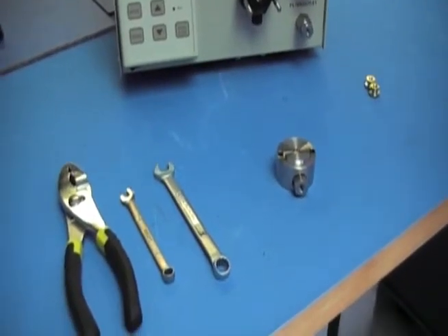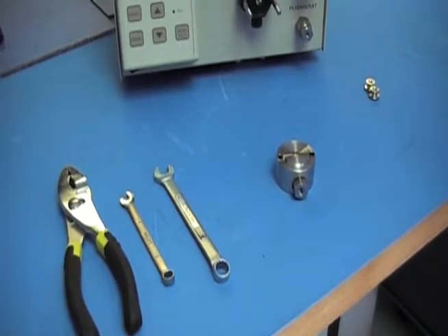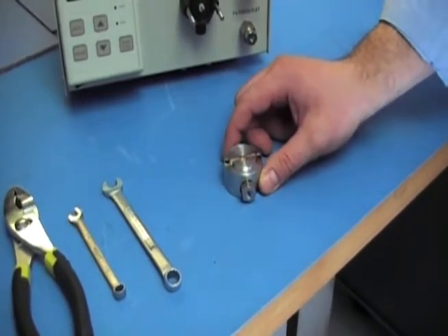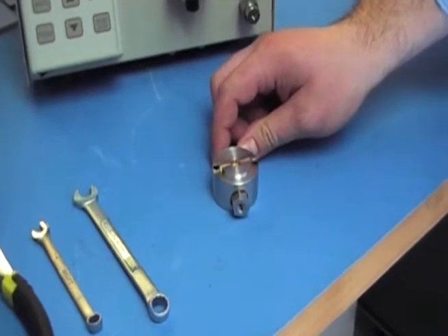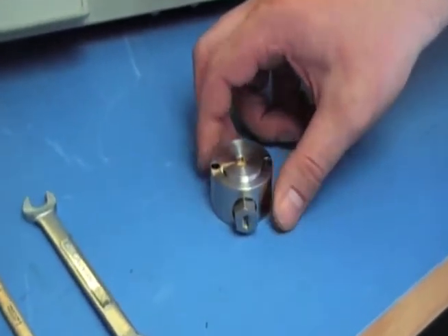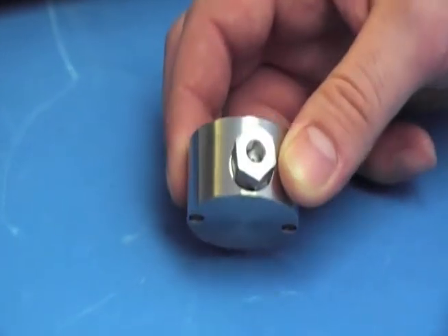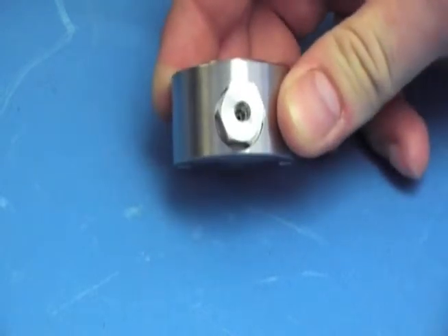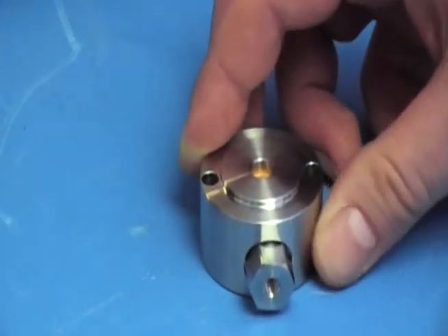After installing the new seal and/or installing the new check valves, you've got to put the head back on the pump. Before you put it on, make sure you have the right orientation so your flow path is correct. The inlet is always the bigger of the two ports — that would be your inlet and that would be your outlet — and the outlet always goes up.